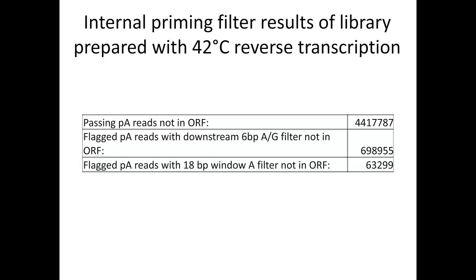So after employing these 3 filters, if we look at the reads from these libraries, the reads mapping to non-open reading frame regions, so these are reads that are mostly in the 3' UTR region where we expect, the filter that we employ filters out roughly 700,000 out of the 5 million reads. And most of the reads are filtered with this downstream 6 base pair AG filter. The other 2 filters remove roughly 10% of that, 60,000 reads.